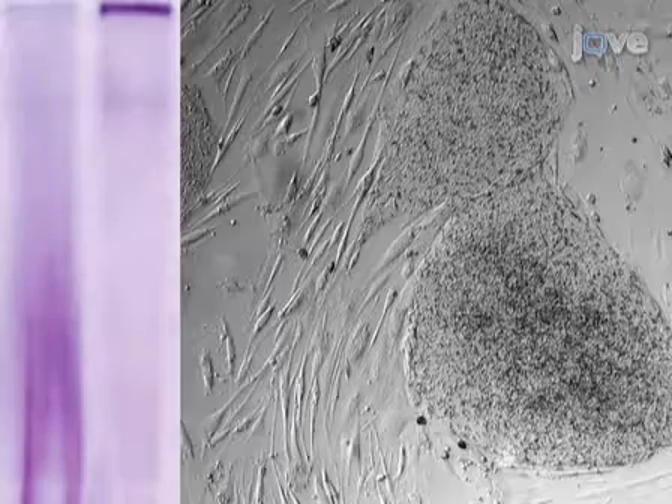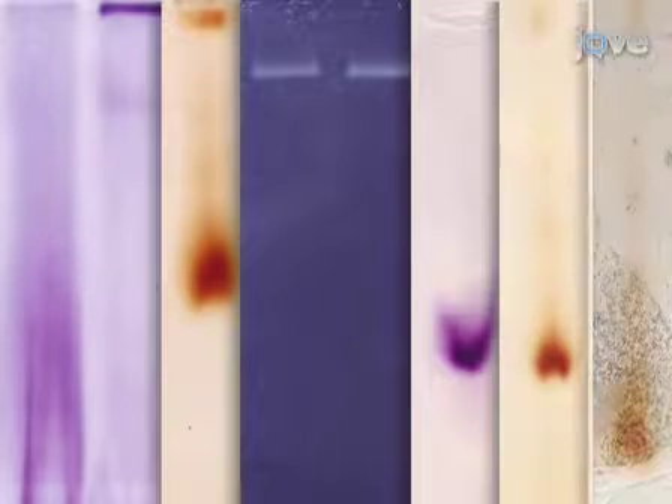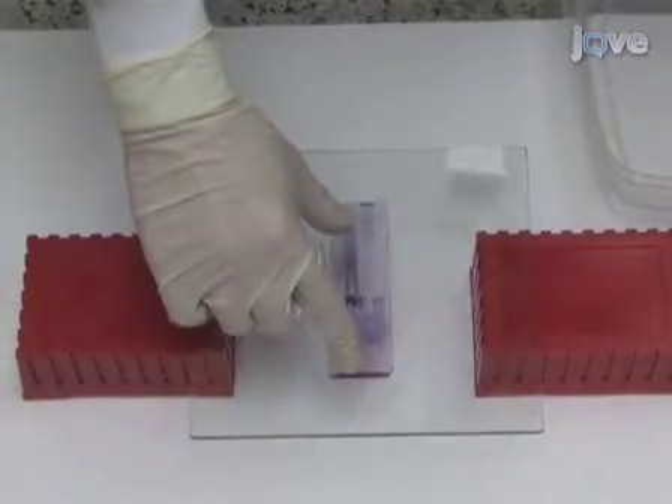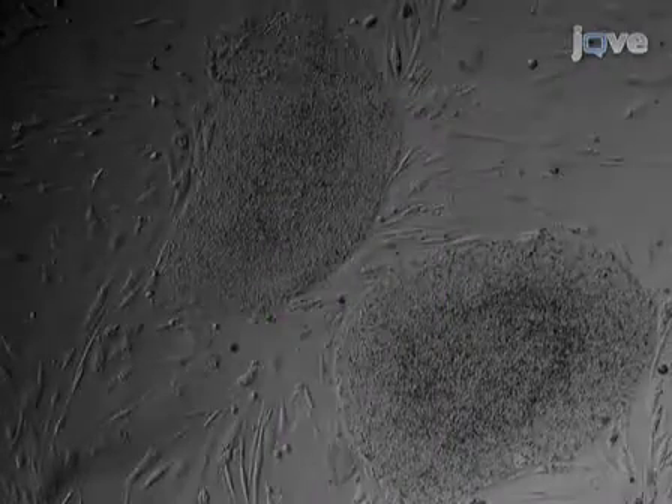In this video, we will show you how the mitochondrial respiratory chain complexes of human embryonic stem cells can be analyzed using in-gel activity assays. I'm Ivan Forostov from the Laboratory of Michael Teitel in the Department of Pathology and Laboratory Medicine at the University of California, Los Angeles. Today we will show you a procedure for assessing mitochondrial respiratory complex function in human embryonic stem cells with in-gel activity assays.